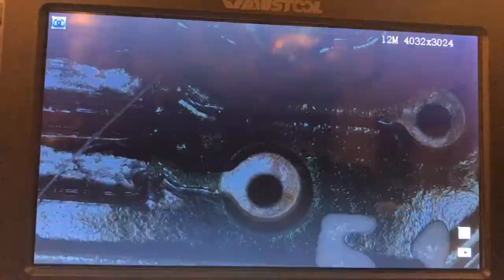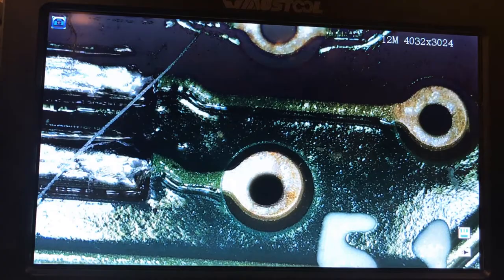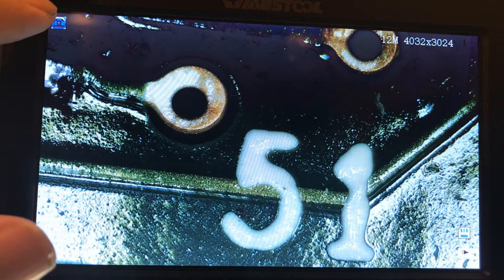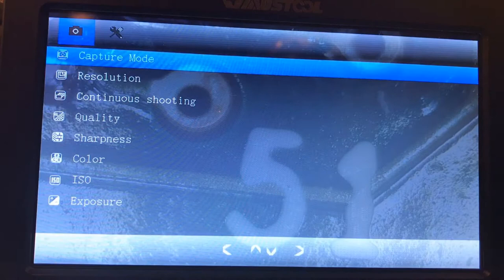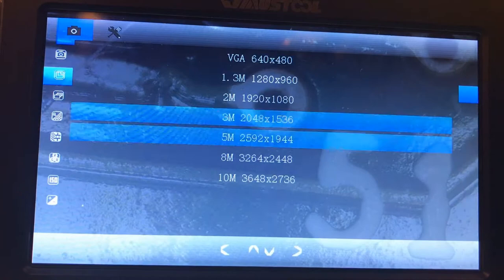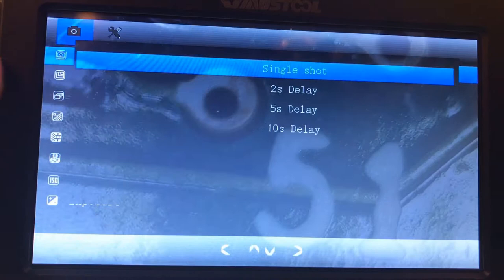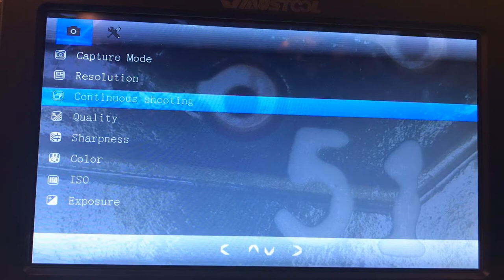If you hit the D button, you can switch to picture mode. One of the things I like is the anti-shake mode, which allows you to push the button and get your finger away — the icon turns yellow and then it takes the picture. One thing a lot of people said is that it only takes 10 megapixel pictures, but it really does take 12. In the menu under resolution, it's not obvious because the main screen ends at 10, but if you keep scrolling down, there is a 12 megapixel option. You can set burst mode, a 10-second delay, continuous shooting, sharpness quality, HDR mode, and anti-shaking mode.